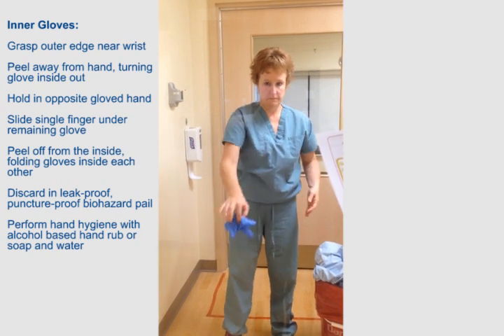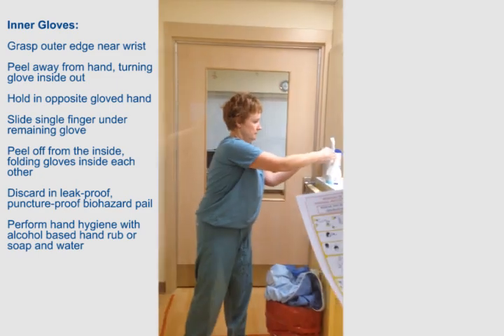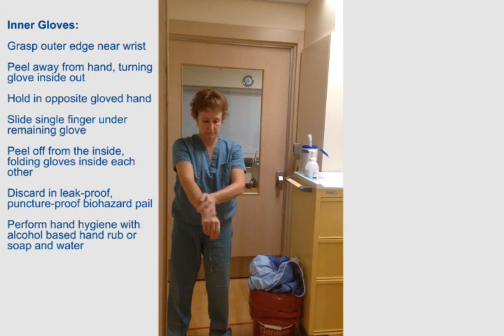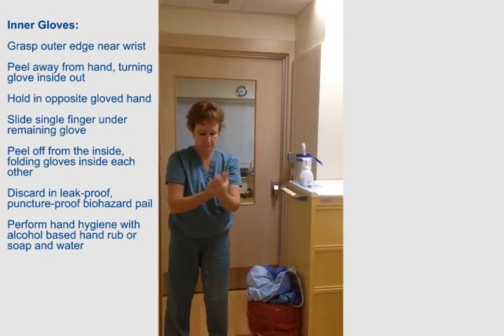Peel off from the inside, folding gloves inside each other. Discard in leak-proof, puncture-proof biohazard pail. Perform hand hygiene with alcohol-based hand rub or soap and water.